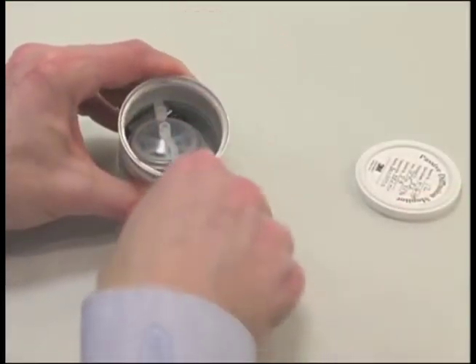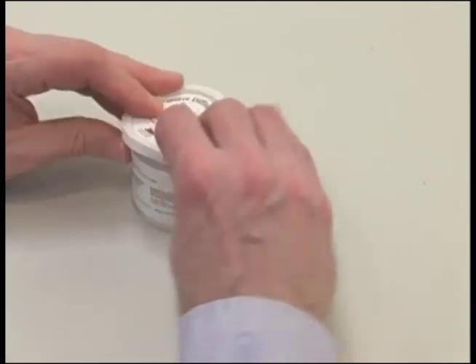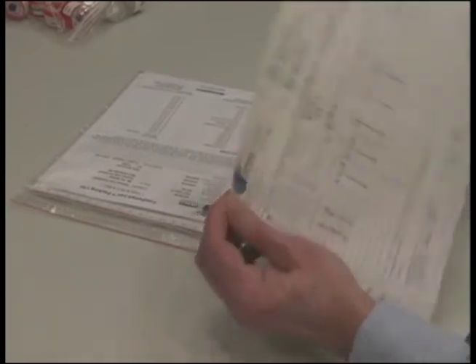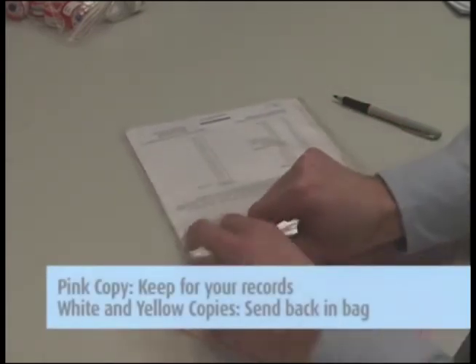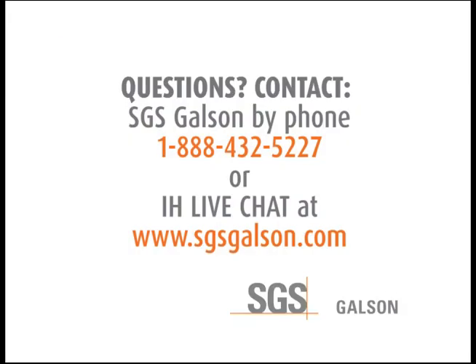Return the sealed monitor sections and the short plastic straw to the can and close it with the white plastic lid provided. Then complete the chain of custody form. It is important that you include all the information requested in order to ensure the turnaround time of your samples. Remove the pink copy and keep it for your records. Send the white and yellow copies in with the samples to the lab in the large Ziploc bag. Contact SGS Galson by phone or IH Live Chat.